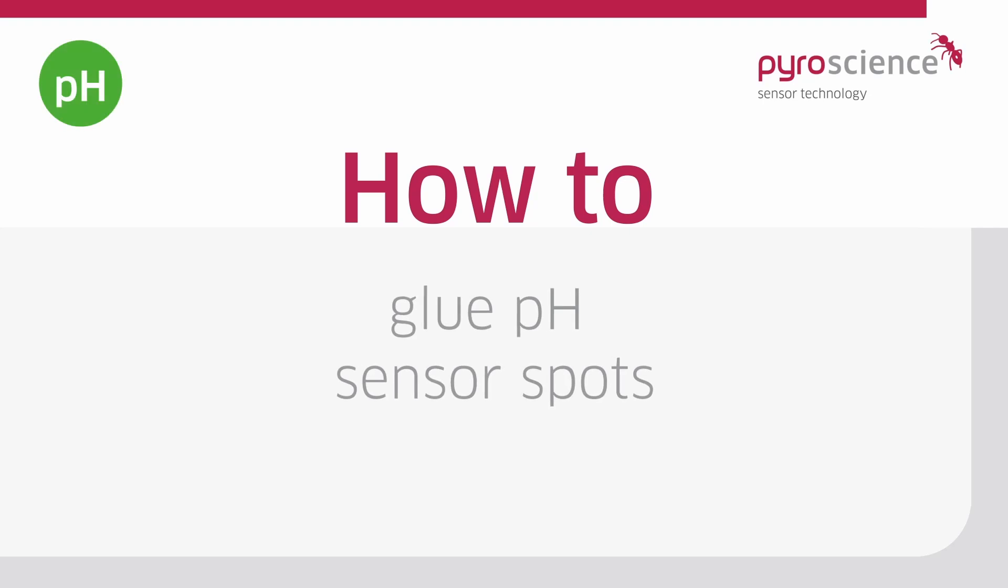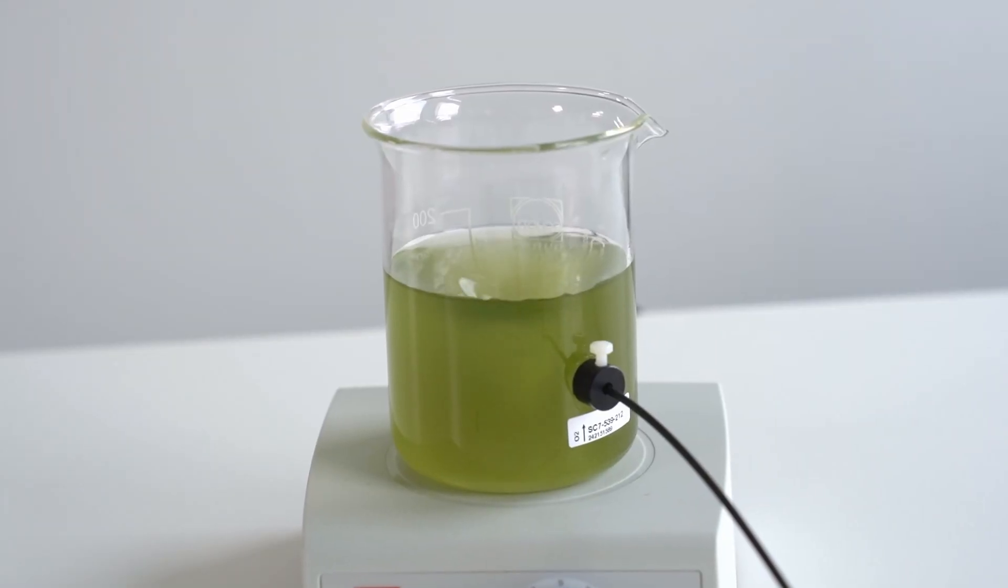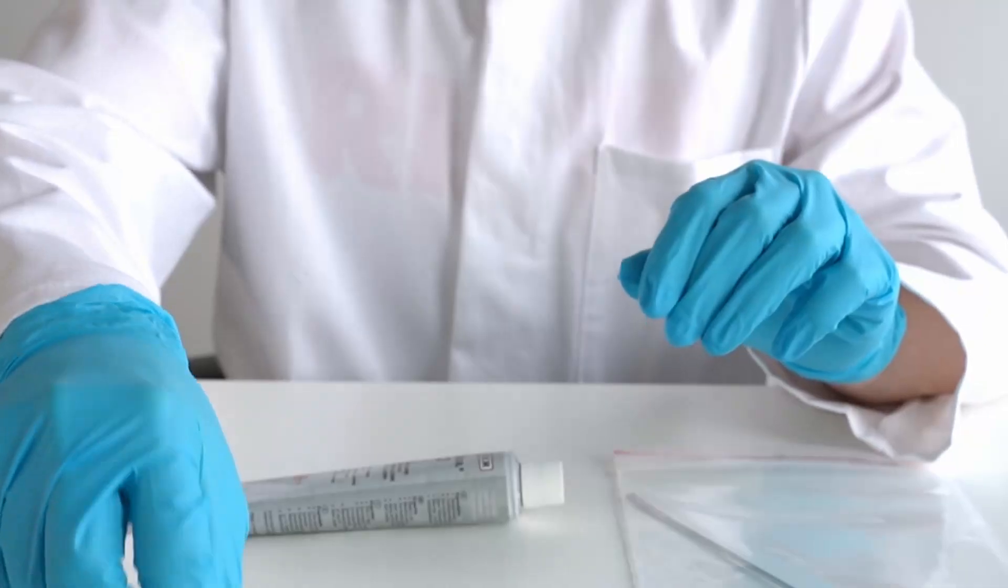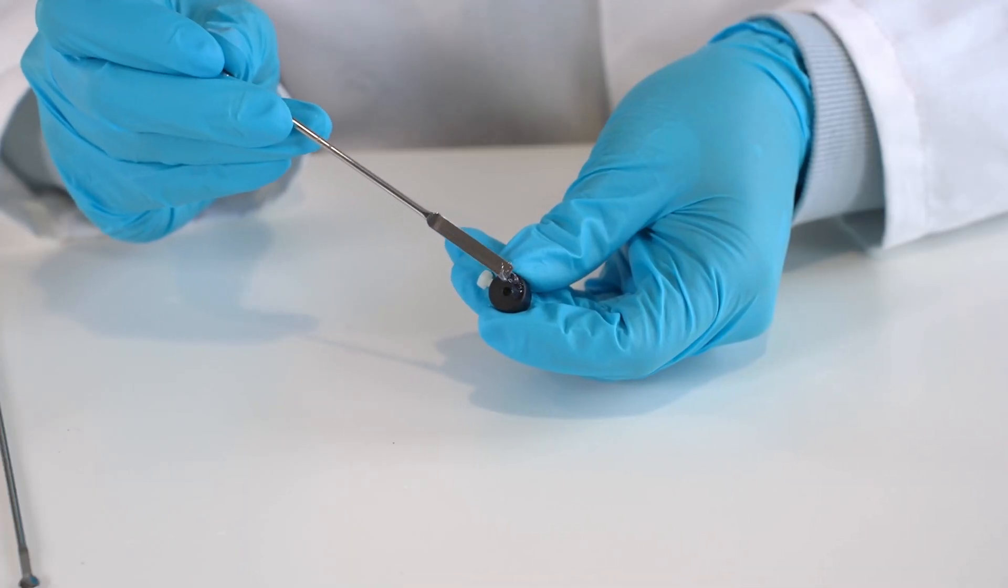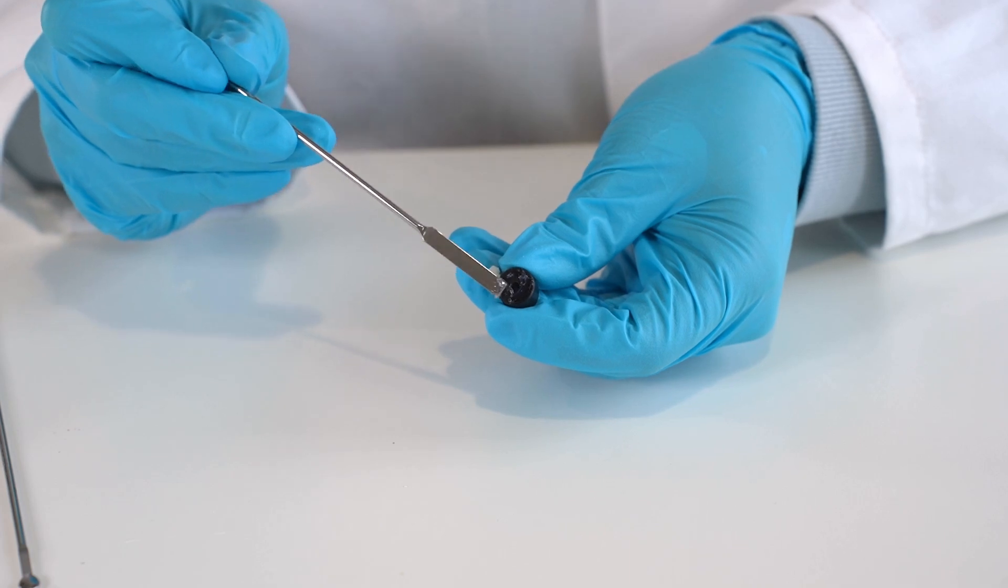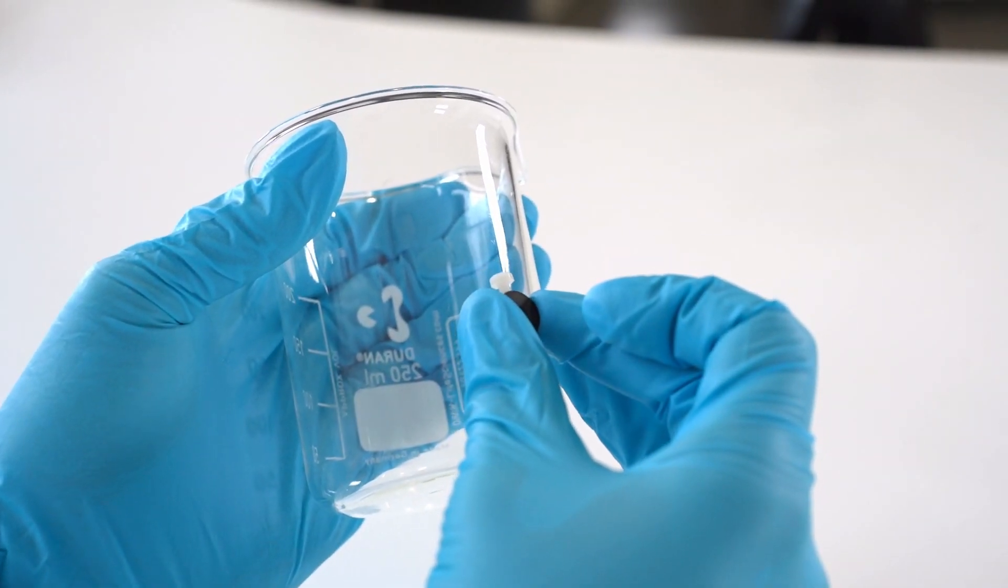For pH sensors, please refer to our gluing guide for pH sensors. To be able to connect readout fibers to the sensor spot, you need to fix the spot adapter spot bus. For this, add some of the silicone glue on the surface of the spot adapter and press it on the outer wall of the sensor spot position.